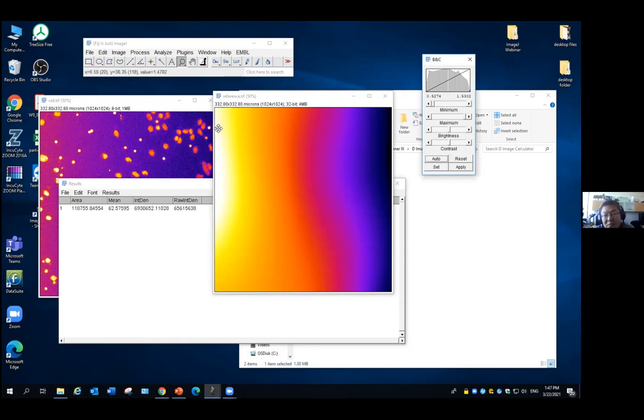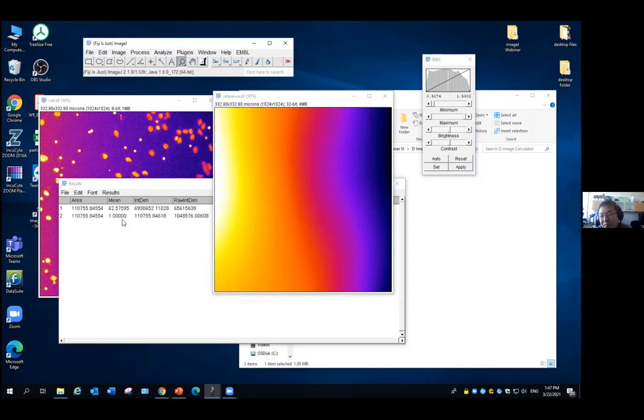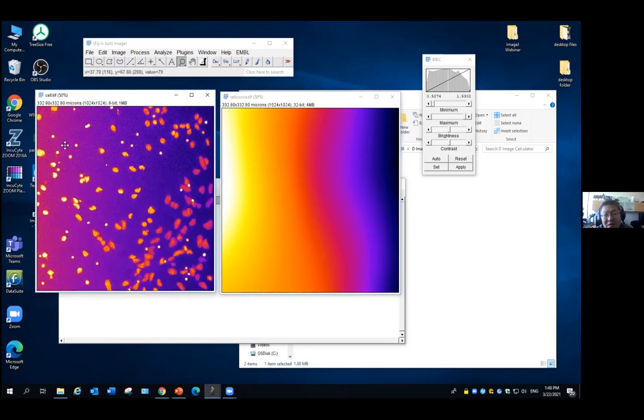Now if you move around, you will see here the intensity is more like 1.5, and this part is more like 0.6. But the mean intensity of this whole field will be about 1. Then we can normalize this image by here. So what I will do is take every single pixel of this image, pick up the intensity value, and divide by the corresponding pixel intensity here. After I do that, I will see what the result image is.